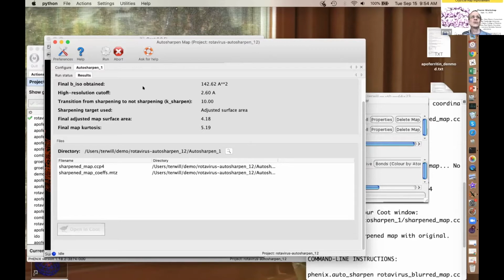Notice that if you're doing global sharpening in this way, you're basically adjusting two parameters. So you can't possibly be biasing your map in any serious way. So you don't have to worry about that. Quick clarification from Valeria: I mean map refinement in Relion. Is the map refinement in Relion different from post-processing, I guess, is the question. I don't know the answer to that question.